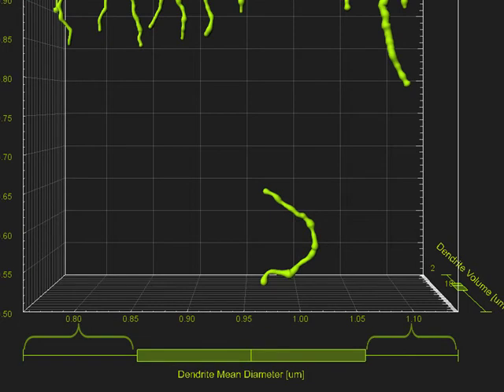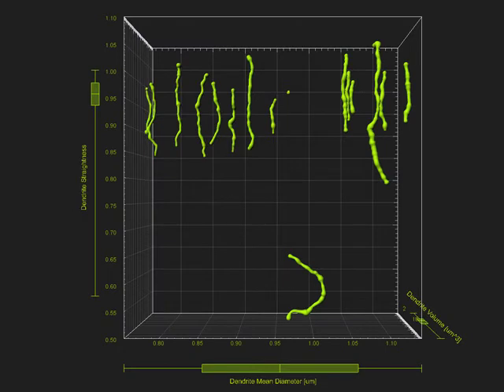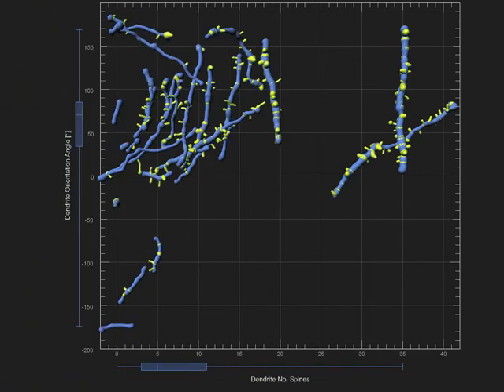The length of the whiskers, the position of the median inside the box, and the space between the different parts of the box provide information about the data distribution or skewness of a set of data. A near symmetric distribution is reflected by 2 whiskers equal in length and the median positioned in the middle of the box. When this is not the case and a plot box is not symmetrical, it can be concluded that the data distribution is not symmetrical. The data distribution is not symmetrical if within the data set there are either relatively more large or small values.